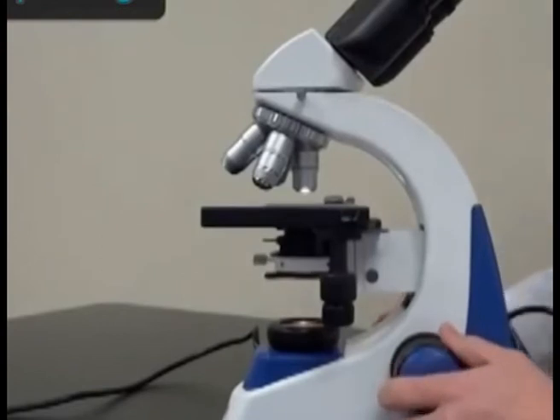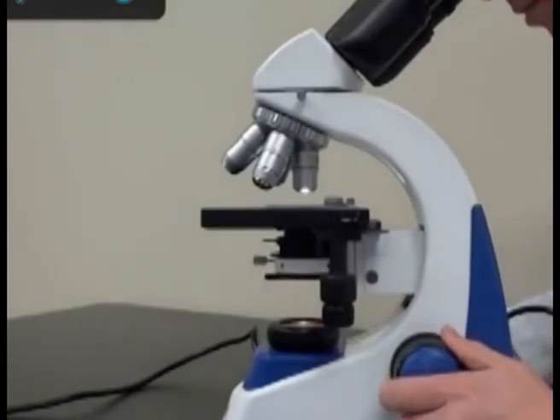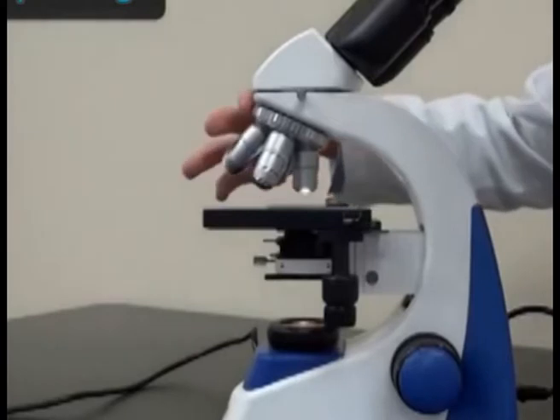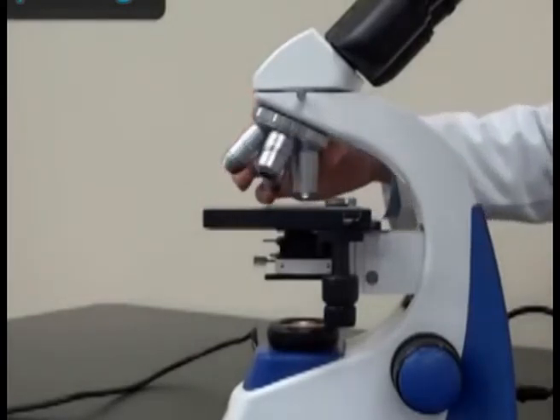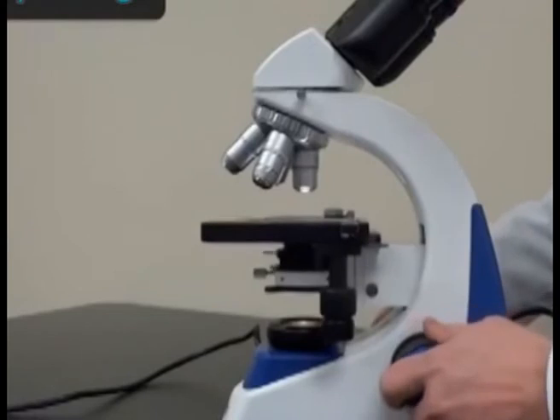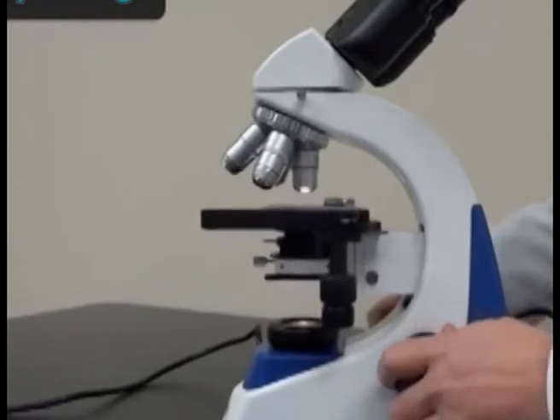Coarse adjustment is effected by a rack and pinion by operating the large knob, while the fine adjustment is effected by operating the smaller knob. In the recent types of microscopes with inclined tubes, there is a single knob on the lower part of the microscope arm with coaxial coarse and fine adjustments, and by operating this knob, the microscope stage is raised or lowered rather than adjusting the microscope tube.